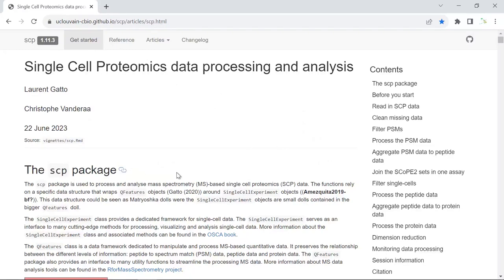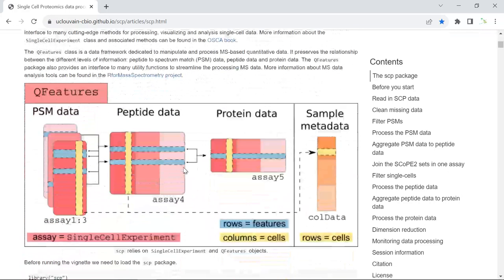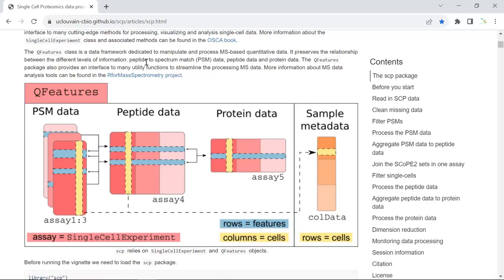For the SCP data structure, SCP relies on the single-cell experiment and also the QFeatures objects to save different SCP data slots. We can divide the data processing and analysis into three steps: first, process the PSM data — PSM stands for peptide-to-spectrum match — then aggregate the PSM data to peptide data, then process the peptide data and aggregate peptide data to protein data. Finally, we can perform data normalization and run PCA to cluster cells for the protein data.